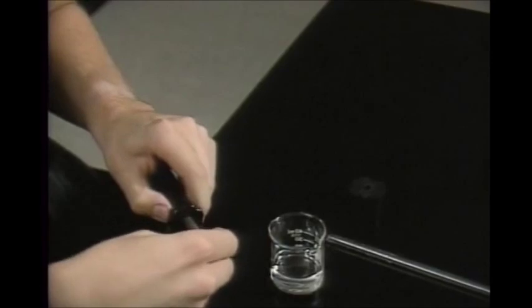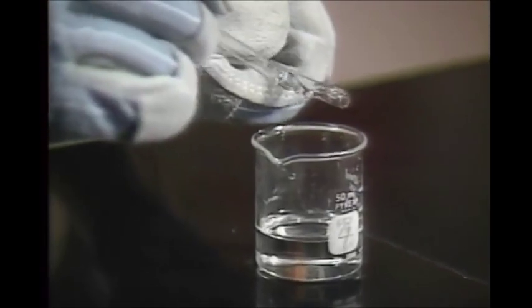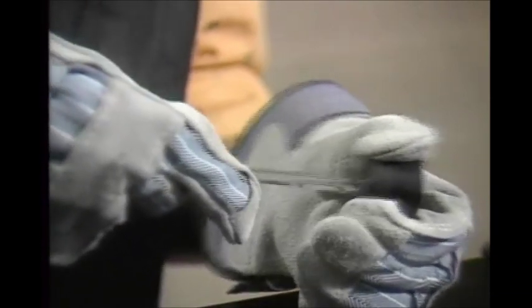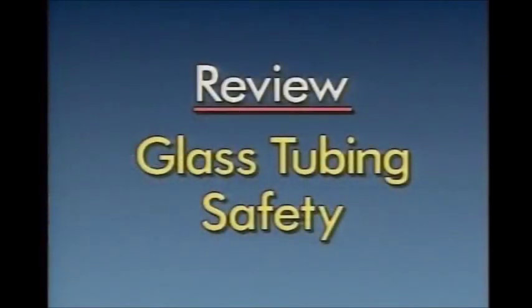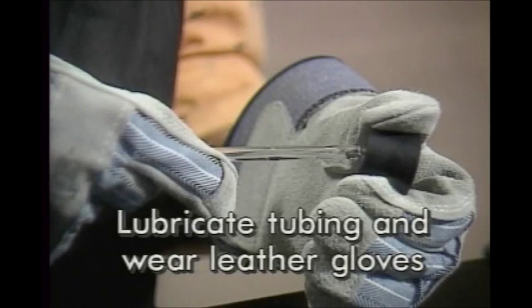Remember to wash the lubricant off before returning the stopper and tubing to storage, and don't forget to replace the tip. If you don't have an inserter, lubricate the tubing instead and protect your hands with leather gloves. Push the tubing gently through — rotate it if there's any resistance. Use the same care when removing it, and don't forget to wash off the lubricant.